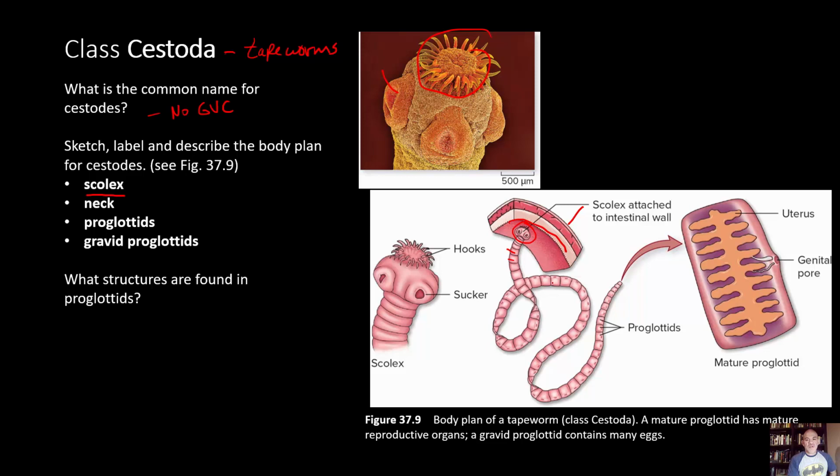So you're hermaphrodite here. And then eventually, as we move towards the back, the eggs have been fertilized, and this is preferably by another tapeworm that's within that intestine as well, because you want to cross-fertilize to promote genetic variation, right? And the mature proglottids eventually will have fertilized eggs, and then we will call that mature proglottid that has fertilized eggs gravid.